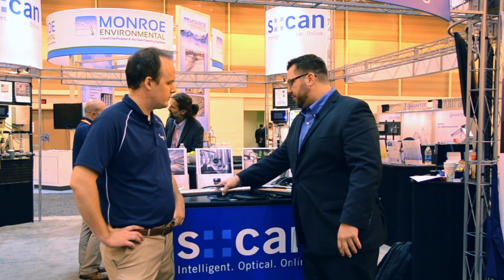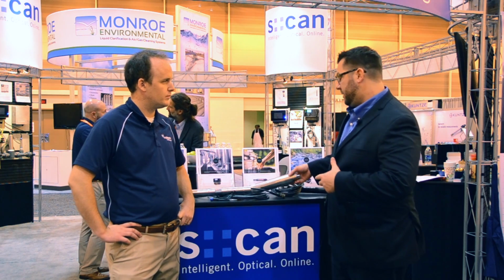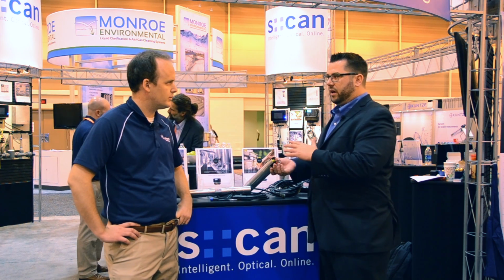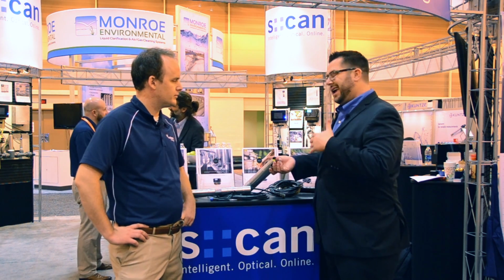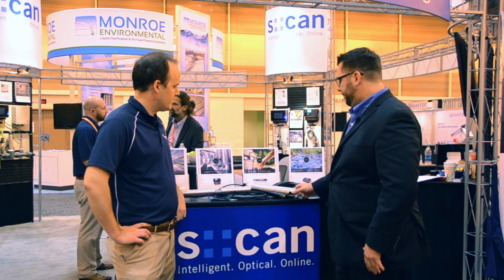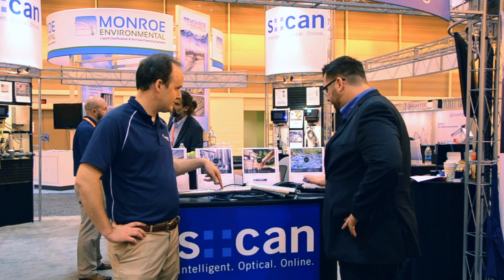The ion selective probe does use electrodes, which means that this probe does need to have the electrodes changed every 6 to 12 months, depending on your water quality matrix. In most cases, it's going to exceed that 12-month life cycle. Okay, cool. And this guy, same deal as this? Same deal as this.